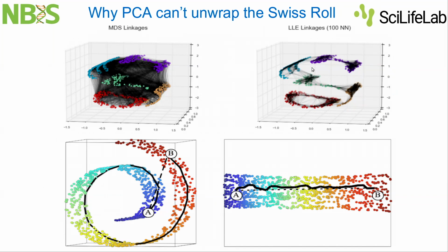And that's not the case for nonlinear dimensionality reduction techniques such as t-SNE and UMAP. They explicitly set some prioritization. They say that my local neighbors are more important than my furthest neighbors. So they don't try to preserve all distances, but they preserve distances between nearest neighbors only. So essentially, you can learn this manifold very nicely. If you go from nearest neighbor to nearest neighbor, you can explore and learn this manifold much better with t-SNE and UMAP.